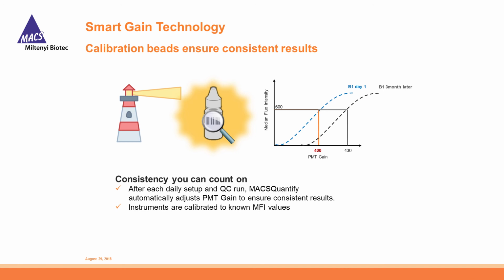What the device will allow you to do is offset for that and account for that with these known fluorescence values and realign so that you stay consistent through your data. And this results in simplicity of kind of universal instrument setting for your assay.